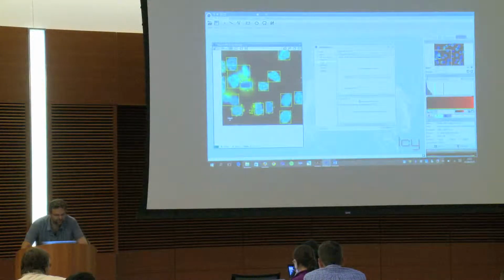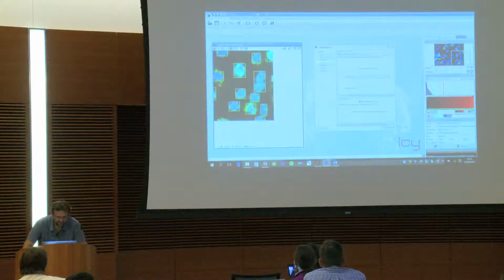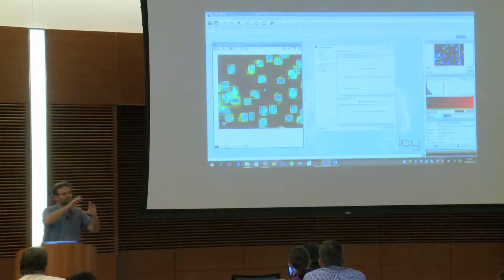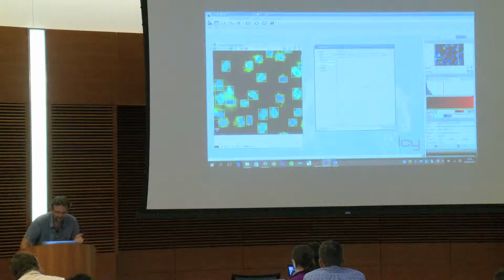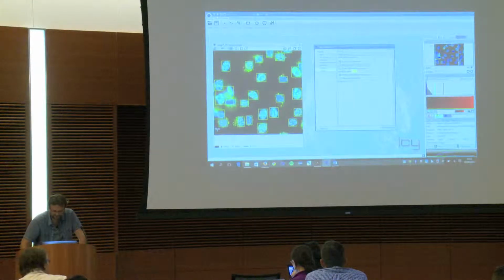So here we have a problem because we have 3 cells that are together, and we have also another problem: the ones on the border here are not consistent in the analysis because all the spots could be on the side of a cell, so we can't use them. And after we have filtering for the size and for all those things, and then you have this output, and finally the display. So when you start this, you see the display is important because you get someone with too much data.